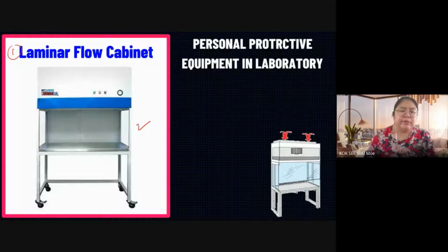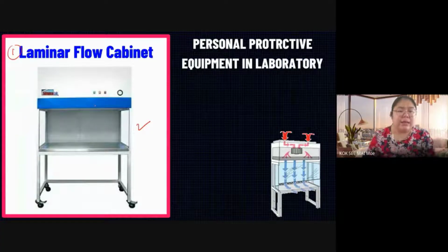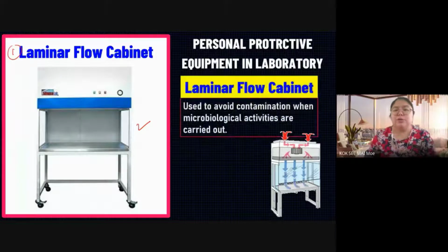Okay, just one of the boxes, then there's an opening. Then you put the thing inside when you want to burn. Okay, let the gas be absorbed inside. Okay, don't let the gas come out. So from here, what is the function? So you need to remember the name and also the function.